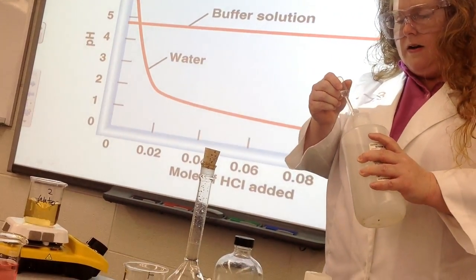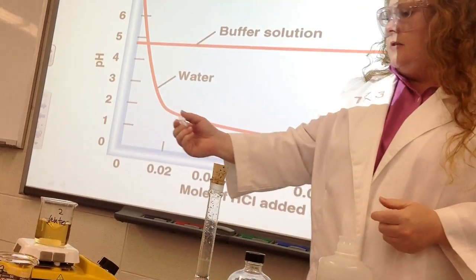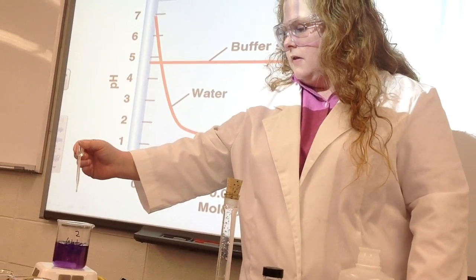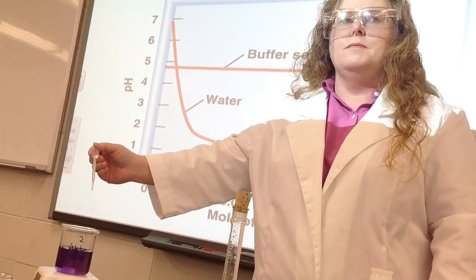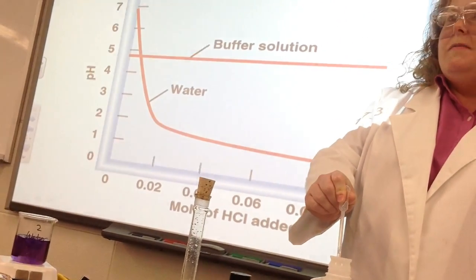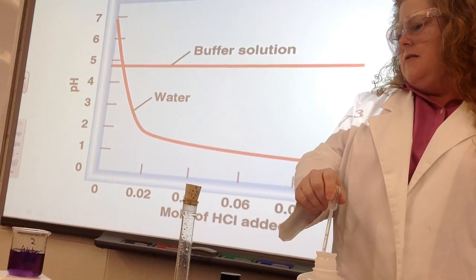So if there is a change in pH I should see a color change. Okay, so we'll go ahead and add. All right, that was just a few drops of sodium hydroxide. You can see there was a pretty big change, so the solution went from the yellow to the purple color.